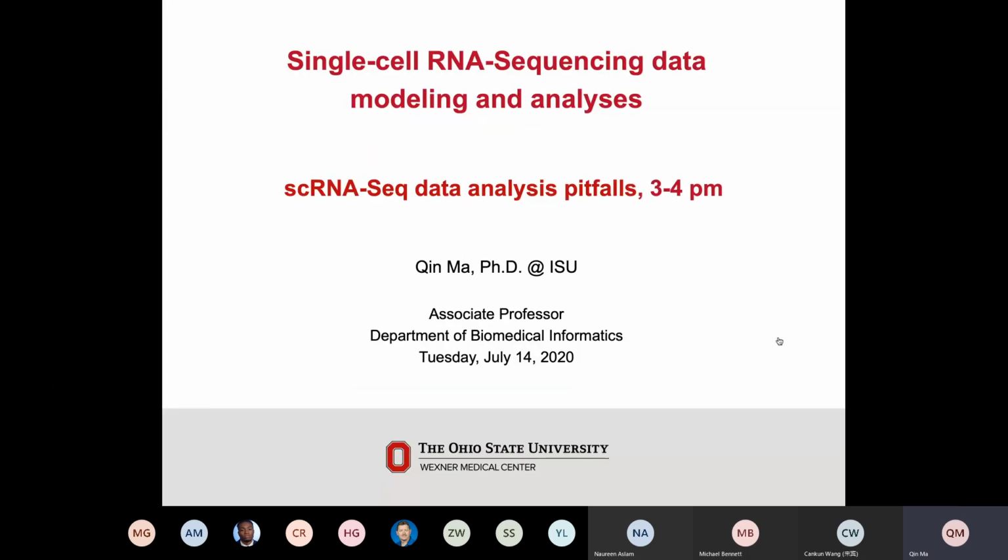And okay, today for the rest, I think I still have about 35 minutes. I guess 30 minutes, and then I will leave some time for questions. So I'm introducing some single-cell RNA-seq data analysis pitfalls. Compared to giving you a list of do's, I prefer to give you a list of do nots. So let's see what kind of pitfalls you might encounter in the future. And if you already know the strategy to take care of those pitfalls, then I think your analysis will be good.